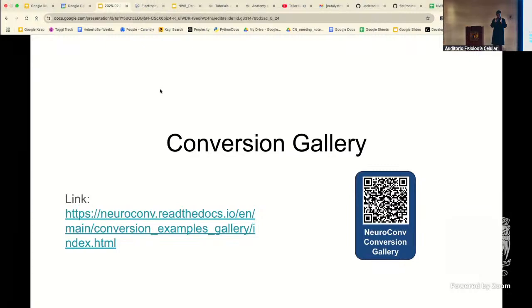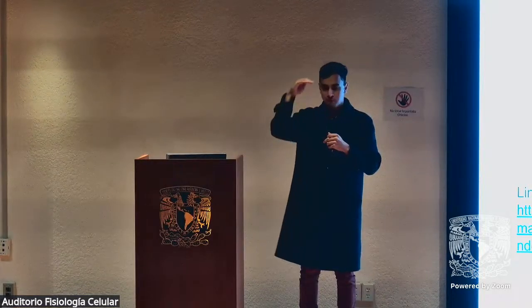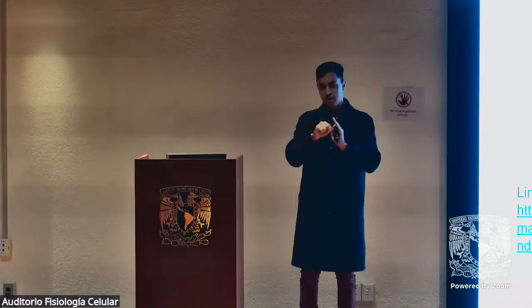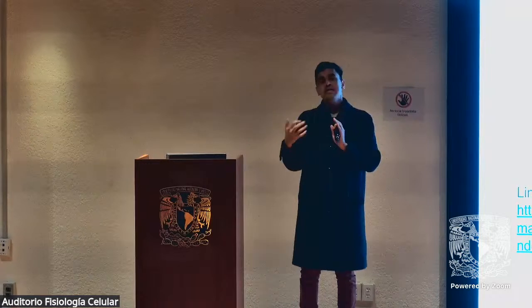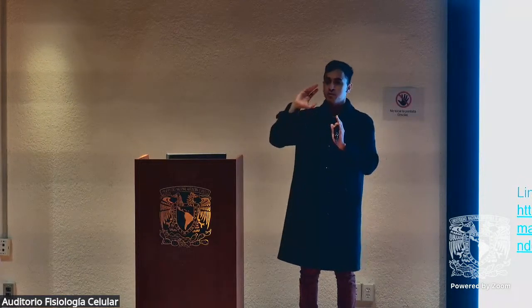So that's one step. Then, as you were mentioning, you have stereotactic coordinates. We don't have a lot of source formats that actually provide that. We have been working on a standard for storing the different coordinates that people use to plan the surgery. And finally, you have the type of location that you get from a post-mortem experiment, of where the electrode actually ended up. You may want to have that localization. At the moment we don't have something automatic that will let you do this in a super easy way, but we already have the structure in place.